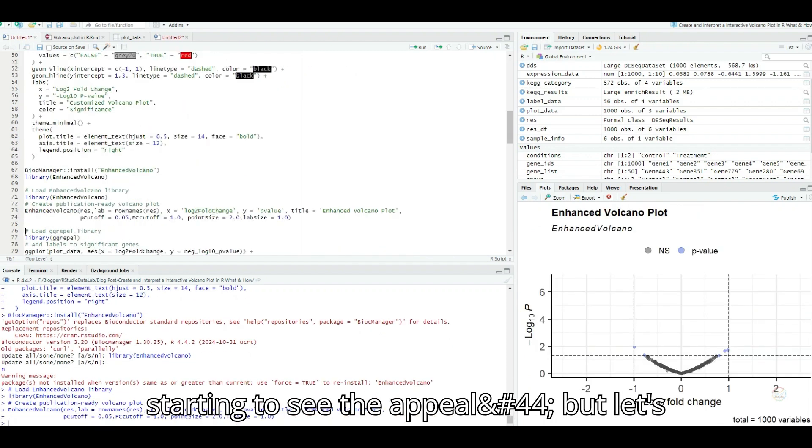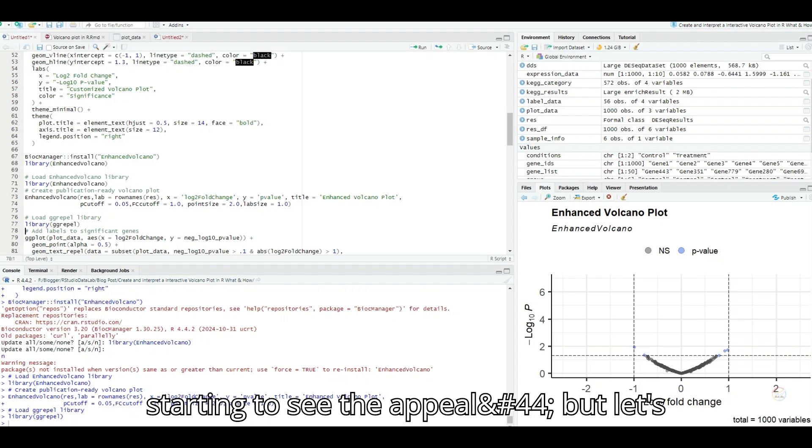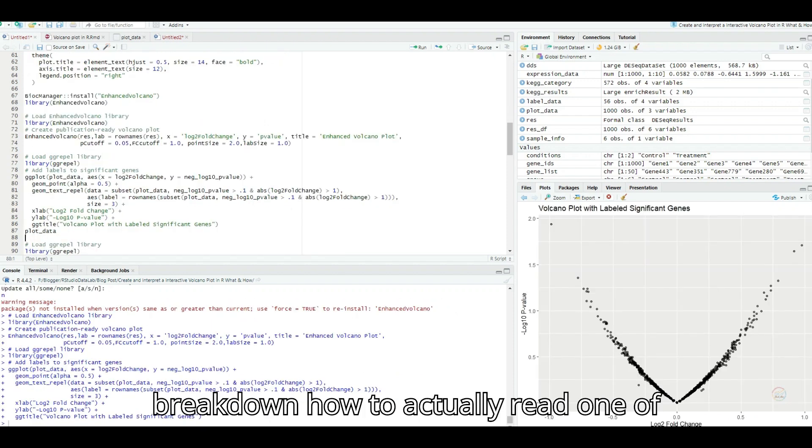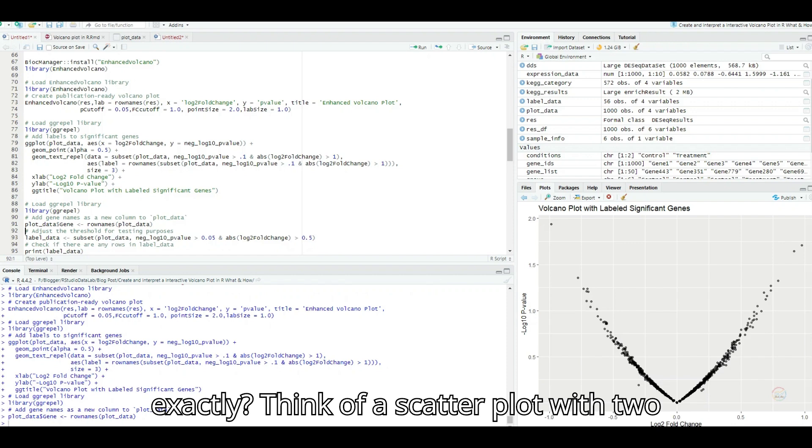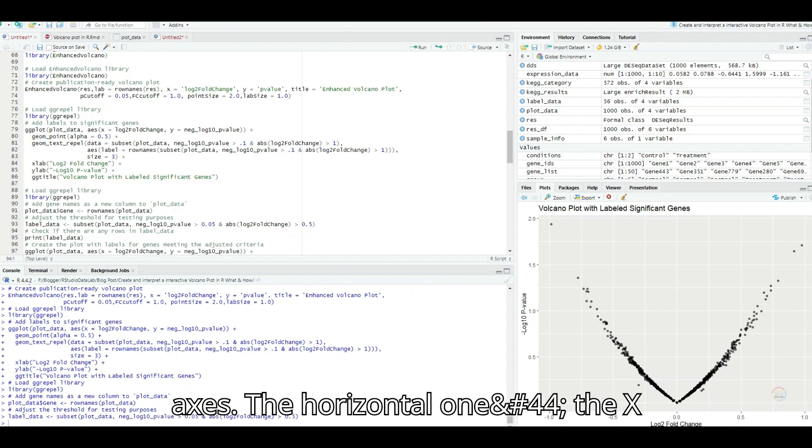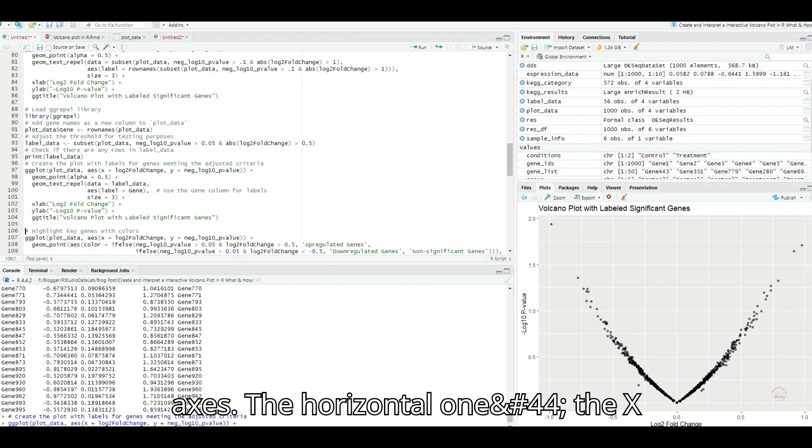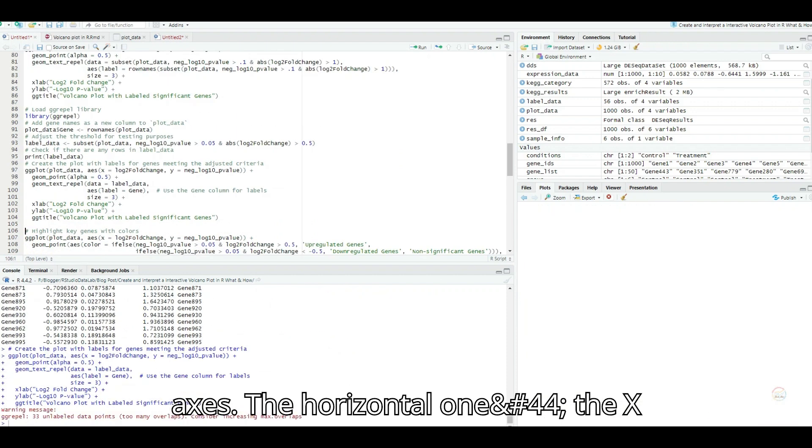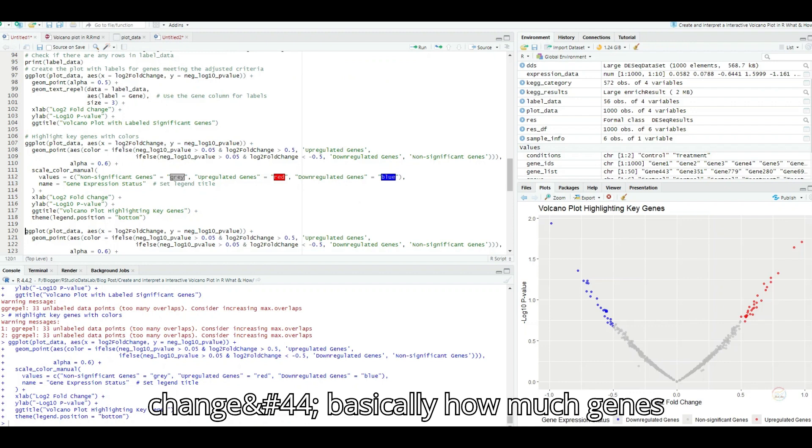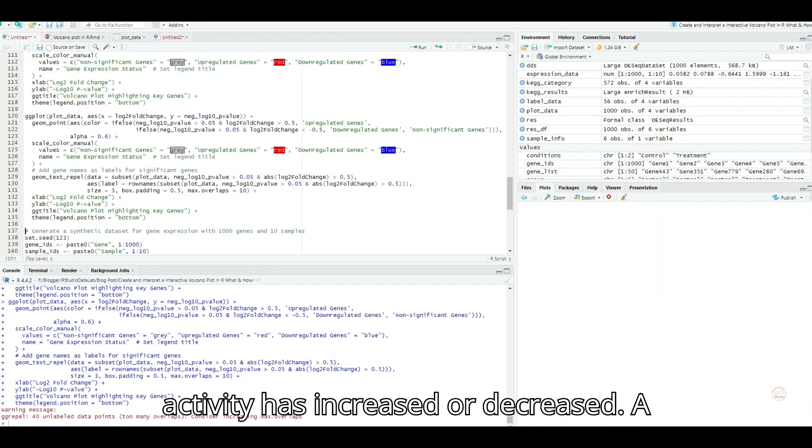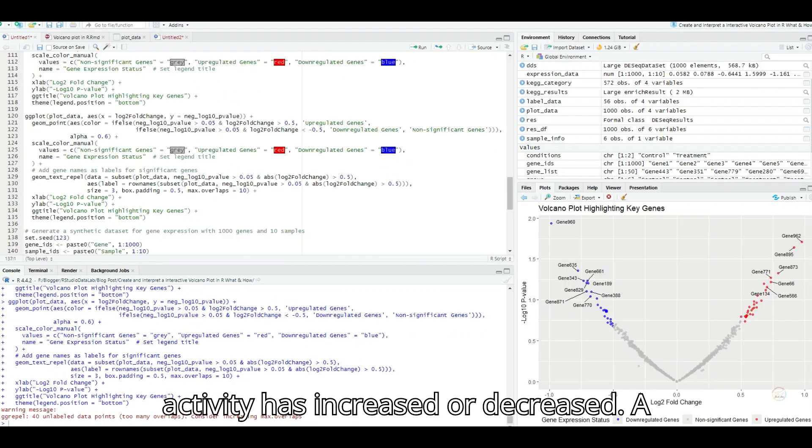I'm starting to see the appeal, but let's break down how to actually read one of these things. What are we looking at exactly? Think of a scatter plot with two axes. The horizontal one, the x-axis, shows us the log twofold change. Basically, how much a gene's activity has increased or decreased.